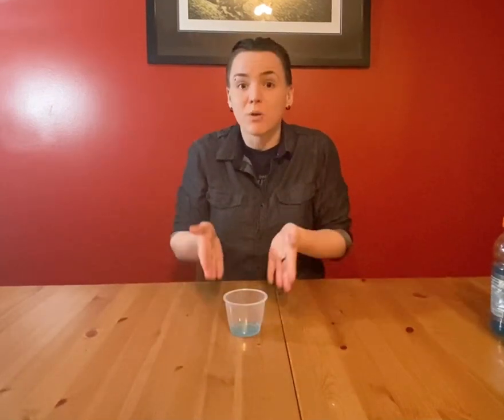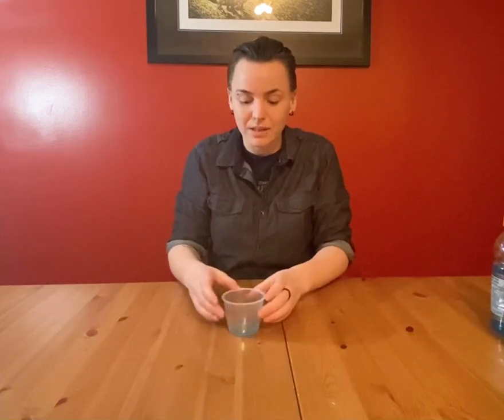So water is not going to rush into or rush out of our cells when I put this in my mouth. It's going to be balanced with the solutes that I already have in my body. So it'll keep the cells intact, essentially. There will be no osmosis that takes place, and that is really important for this experiment.